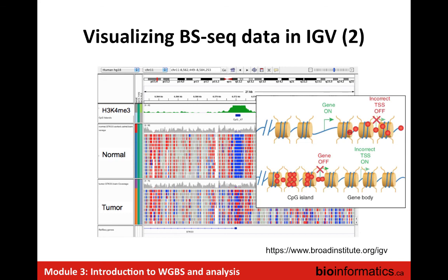And this is really an example of what Martin says is no longer true in terms of what potentially happens in tumors. This is an example of a promoter that clearly has a differentially methylated state between the normal and the tumor. So again, we'll generate these tracks and navigate in the browser to look for this as well.